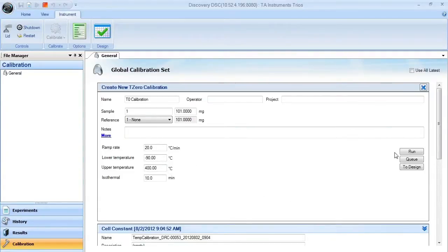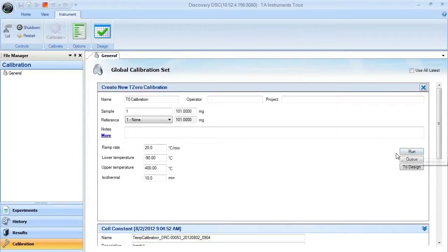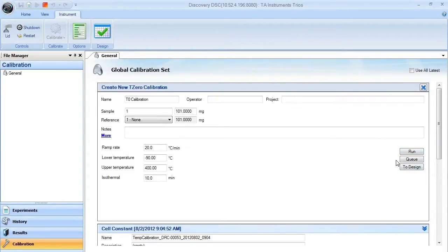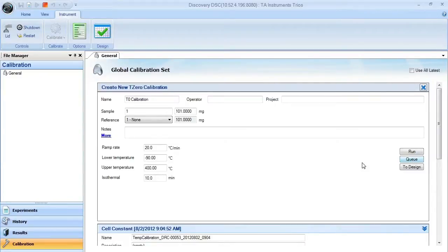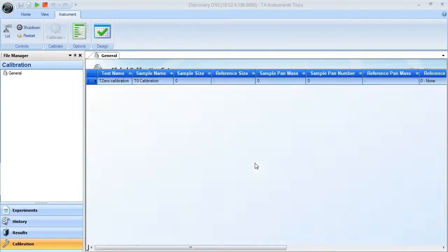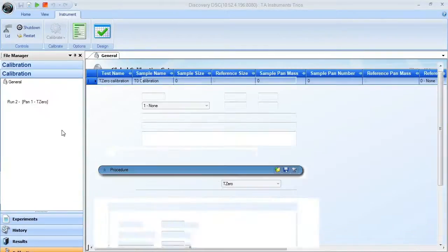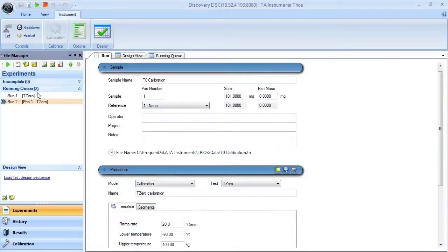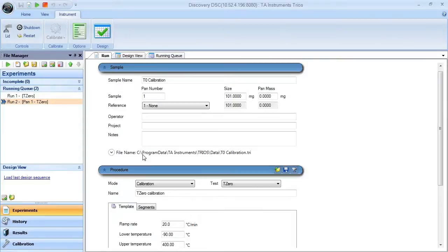you can either place it directly into the running queue and start running automatically, place it into the design view, or in this case we will select running queue to put it into the running queue for us to run at a future date. Here we're prompted to examine it in the running queue. Once it's in this position here, we can then say start and start these experiments.